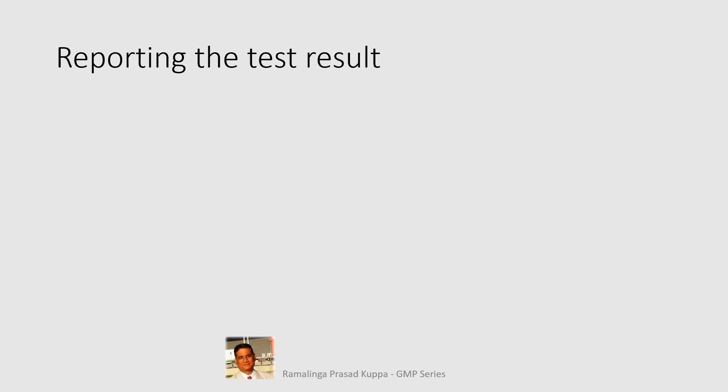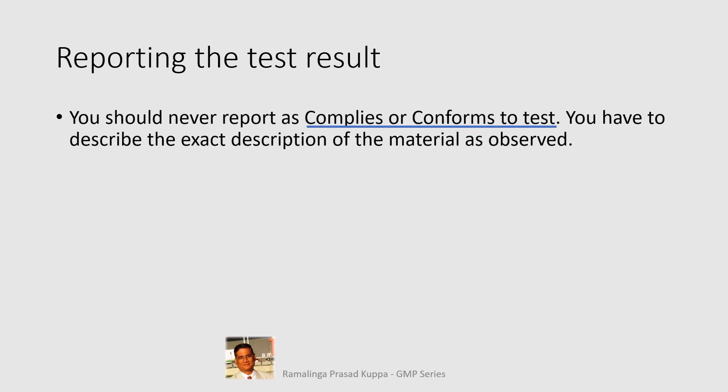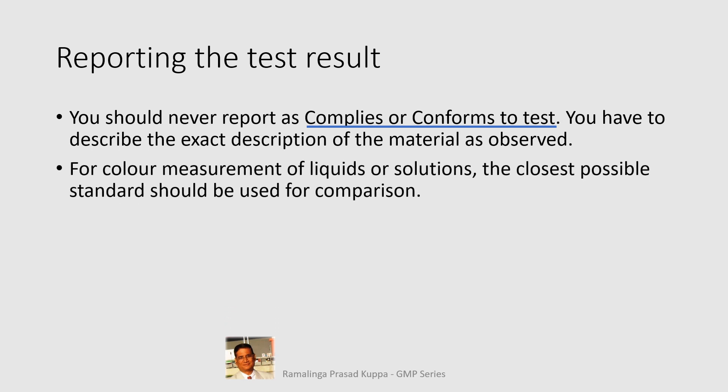Let us see how results are reported. You should never report as 'complies' or 'conforms to test' — you must describe the exact appearance of the material as observed. For example, if the specification says the powder should be white to off-white, you must describe whether it is white or off-white, and cannot report as 'complies' or 'passes test.' When the specification says white to off-white, the expectation is that the product should be closer to white. For liquid color measurements, the closest possible standard should be used for accurate comparison.